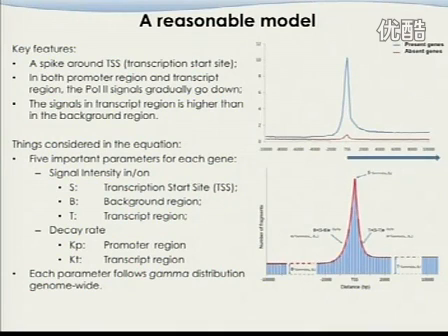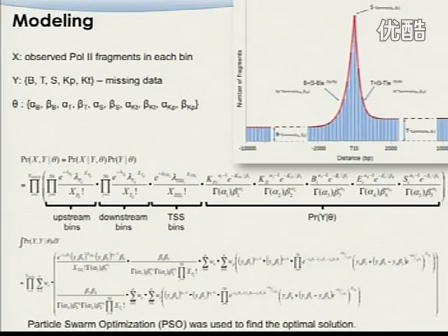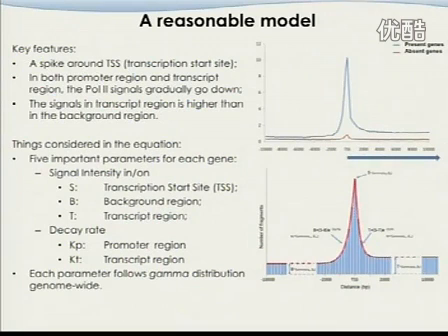Let me see whether the next slide has this. All right, let's go back. We'll spend the rest of the class to talk about the equations, but let's first look at this. Basically, we just use several parameters to model this shape.